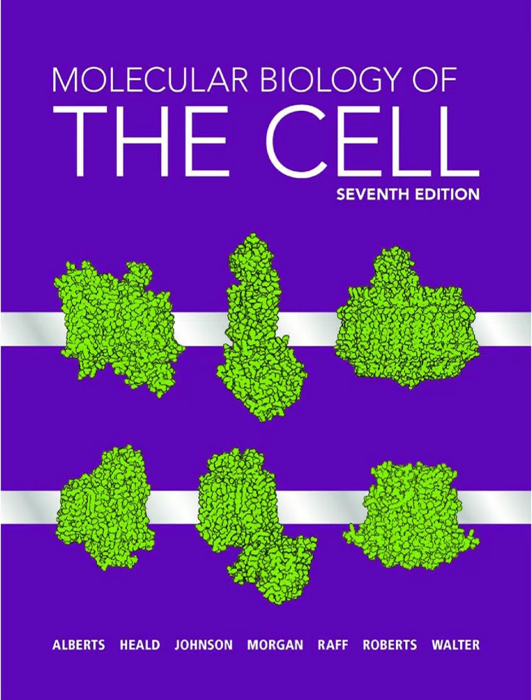Hematoxylin stains acidic things like DNA blue-purple. Eosin stains basic things like cytoplasm pink. The classic purple and pink histology look. That's the one. But for pinpointing specific molecules, you really need something more targeted, like fluorescent probes. Which brings us to fluorescence microscopy.